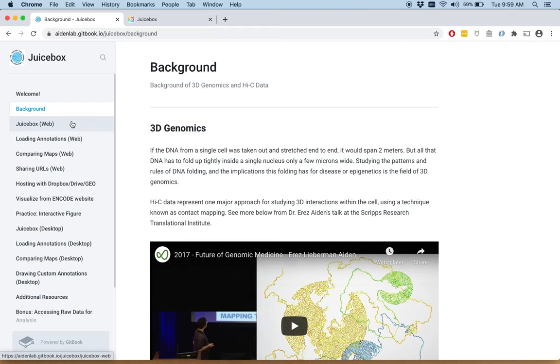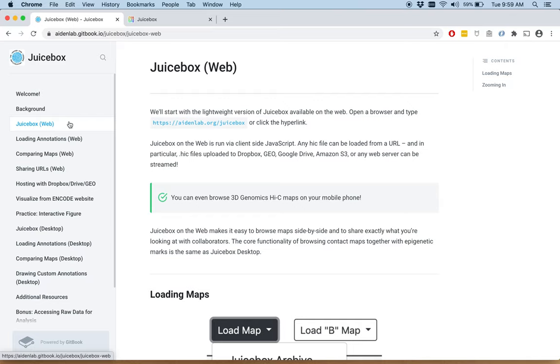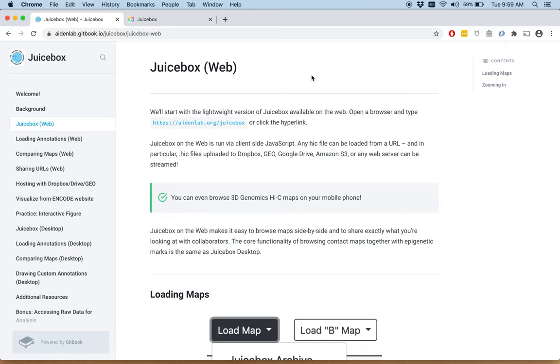Now, let's get started. We'll start with the lightweight version of JuiceBox available on the web. If you haven't already done so, click the link and open it in a new tab.